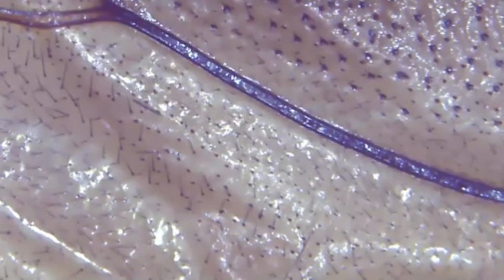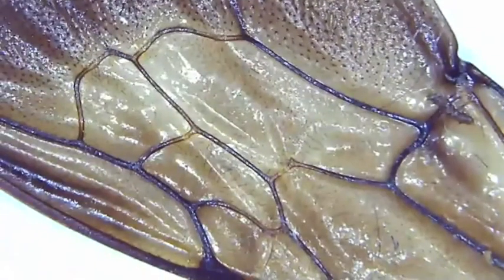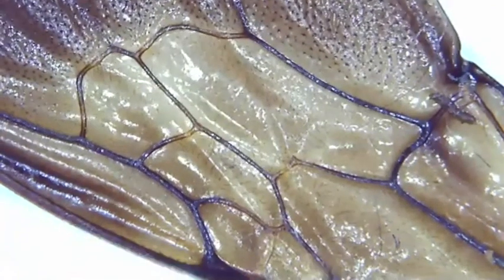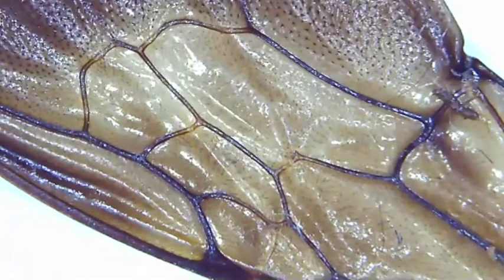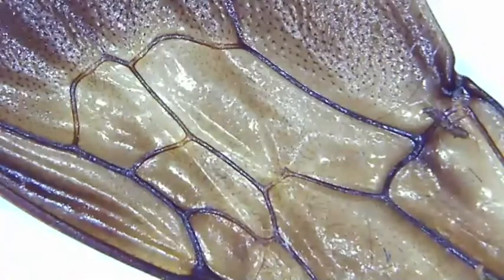What about if we zoom out a little? Do you think we would see more if we zoomed out? Does it still look like it's inside the human body, or do you want to make another inference or observation about that? Yeah, Nipan, what do you think? Now it looks a little more like a chicken bone. Oh, that's cool. That looks like a frog foot. Frog foot, cool, okay.